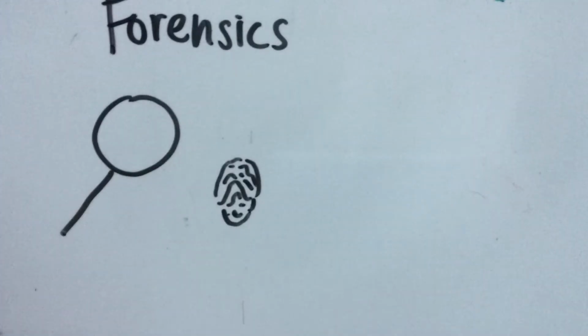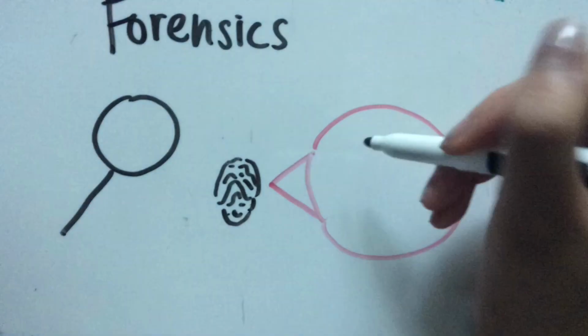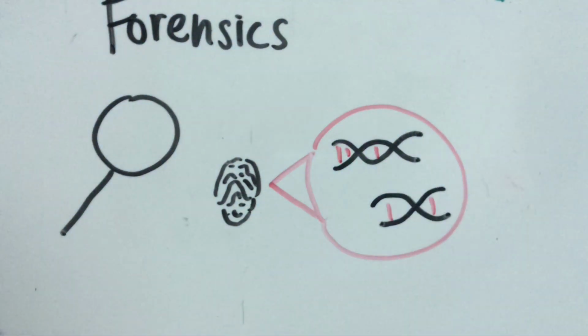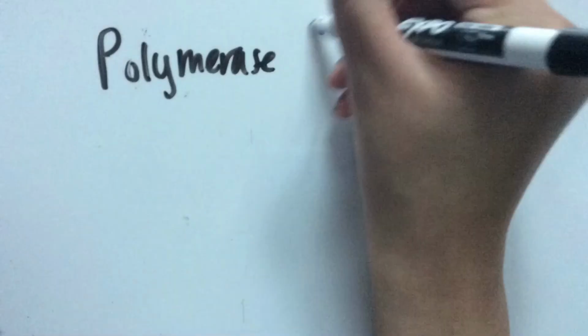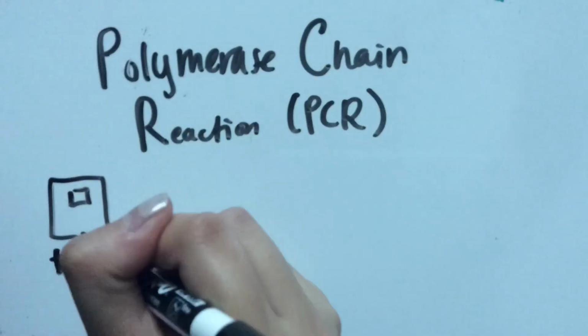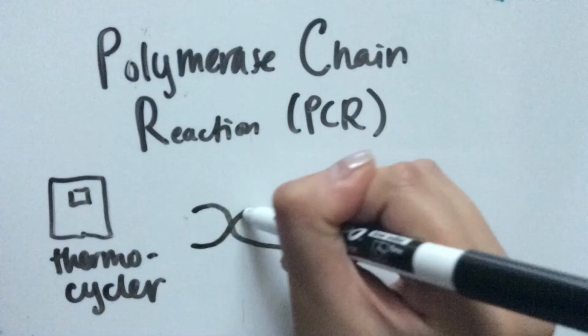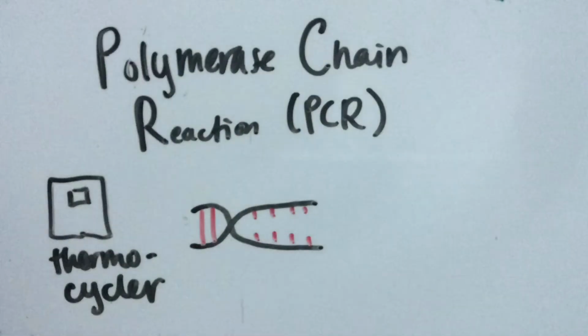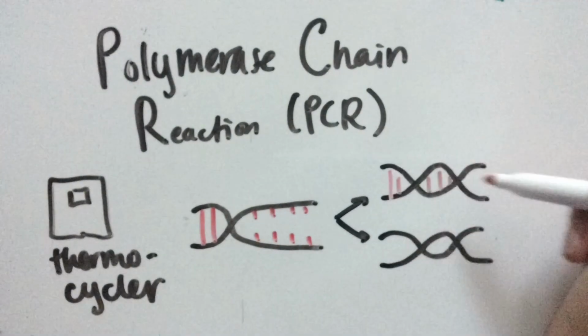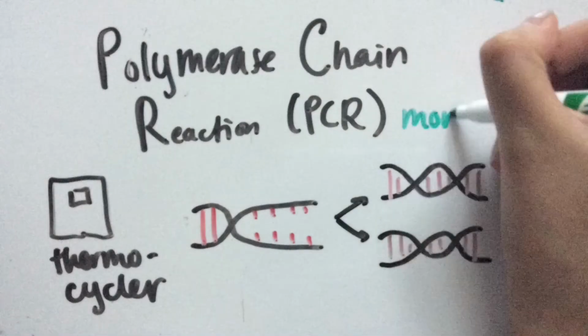Being able to compare the lengths of DNA fragments can be used in forensic sciences. As the DNA migrates, the bands from each well can be compared to each other to look for similarities or differences that may aid in forensic conclusions. Bands that travel the same distance are the same size. Additionally, gel electrophoresis is an important stage in DNA sequencing. After DNA is amplified using polymerase chain reaction, an important step is the purification of the PCR product. One approach to this purification is aided by gel electrophoresis.